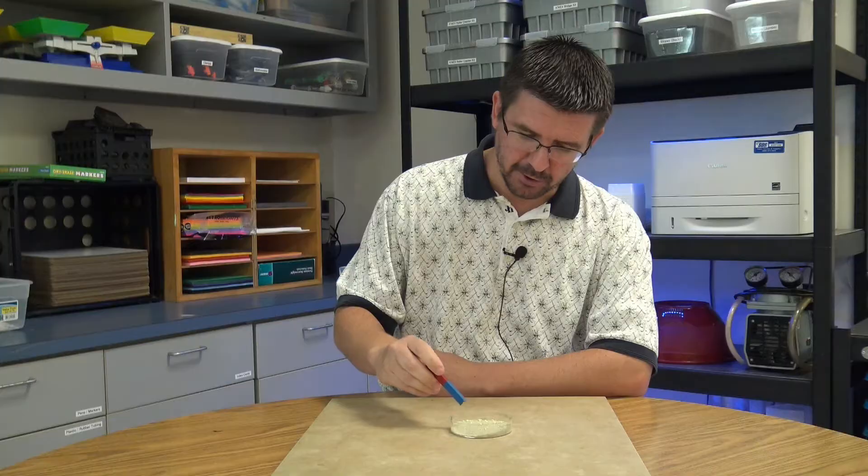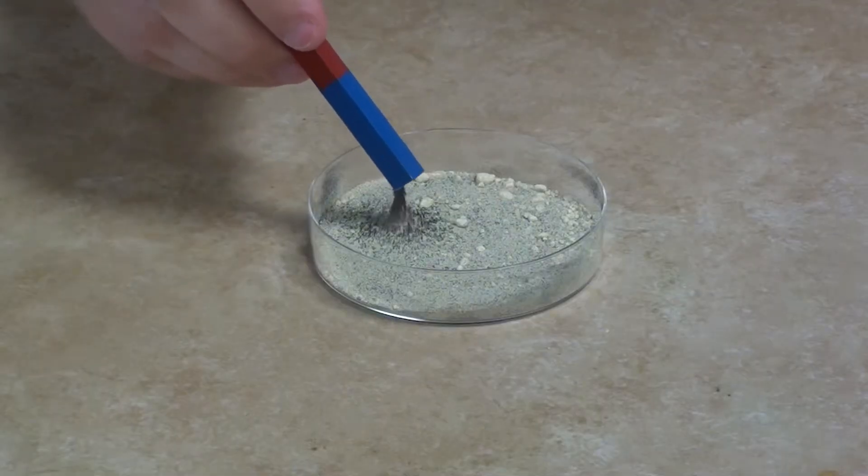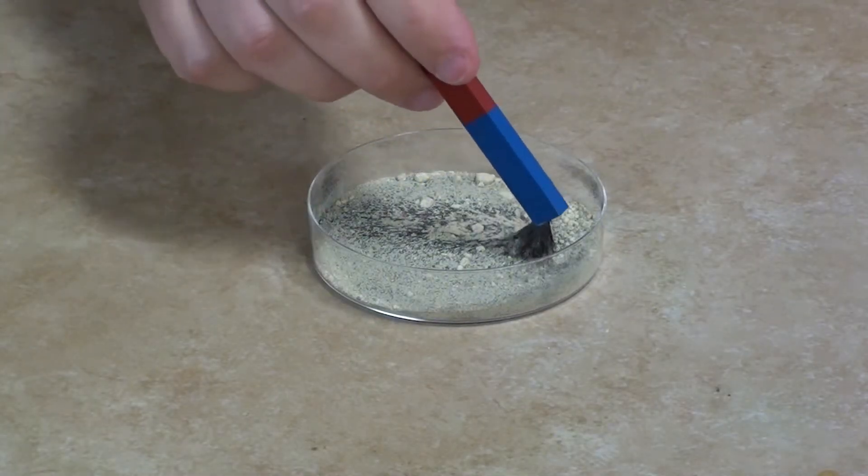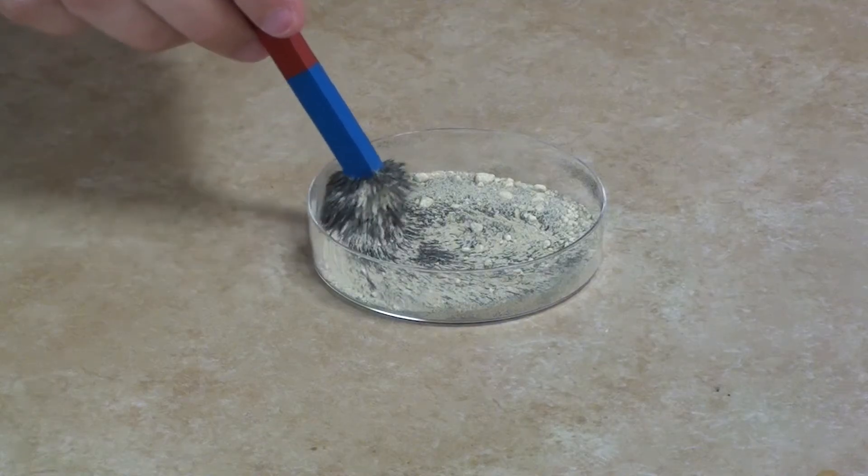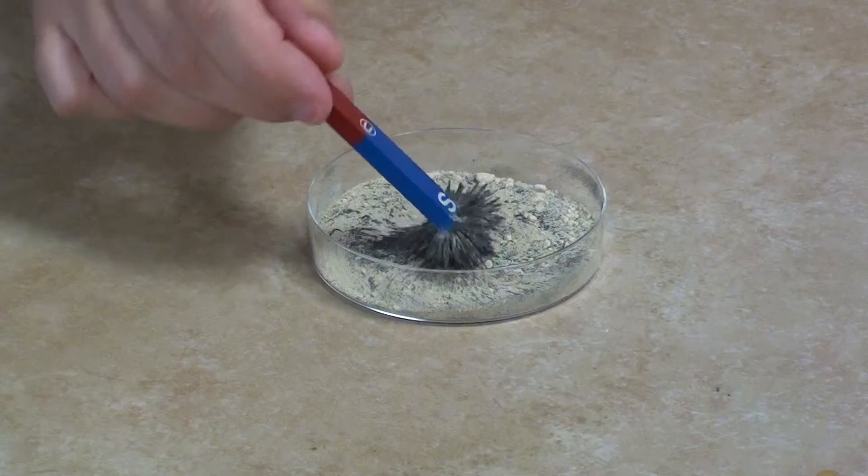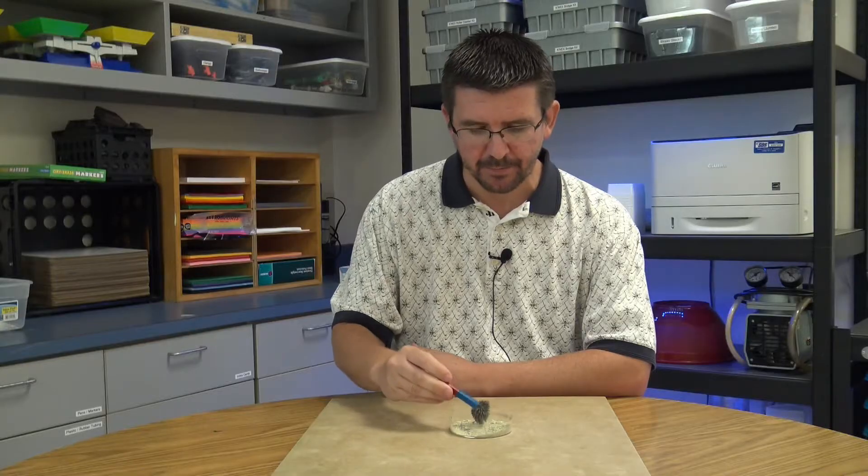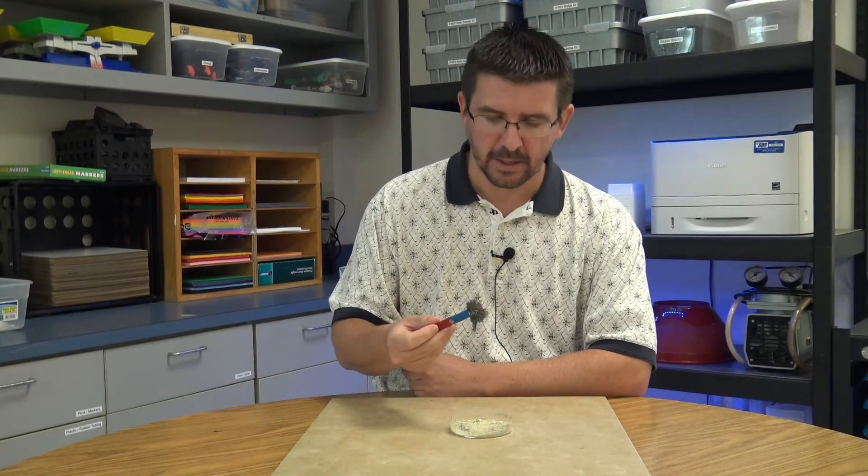So in order to separate these two chemicals, all I need is a magnet. You can see as soon as I place the magnet near this mixture, the iron immediately starts coming out of it. So we're actually able to use a magnet to separate a ferromagnetic material from a non-ferromagnetic material. We're able to separate the iron from the sulfur.